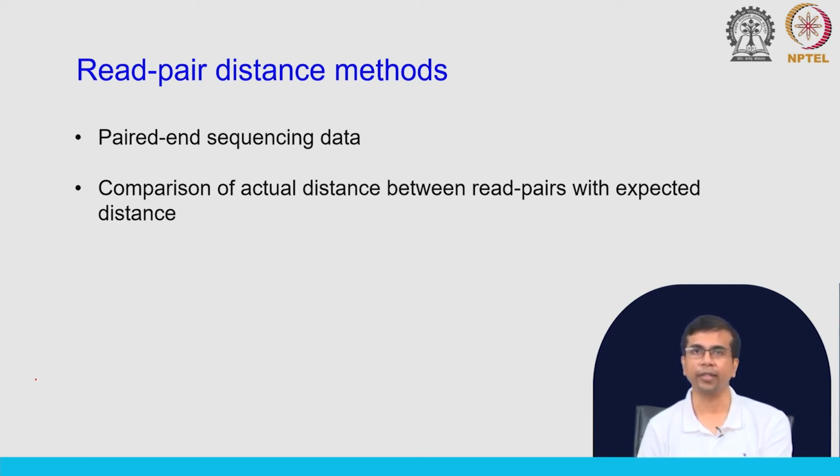It is not just the distance, but also sometimes, in the case of other complex SVs, you can have a change in orientation. If you have a change in the distance, that might tell us there might be a structural variant present in the sample.